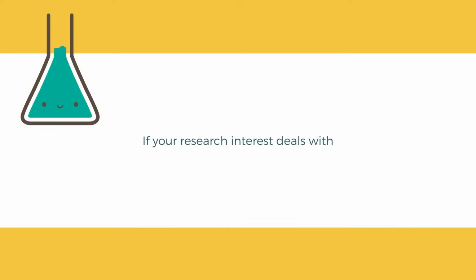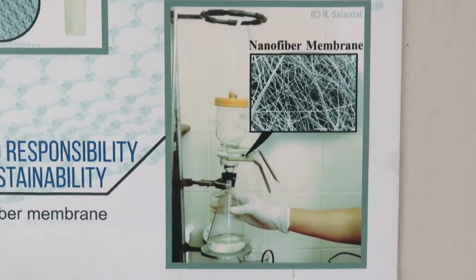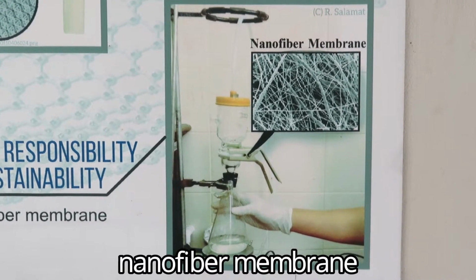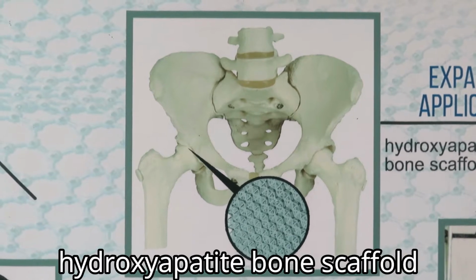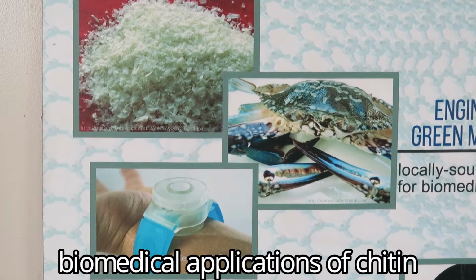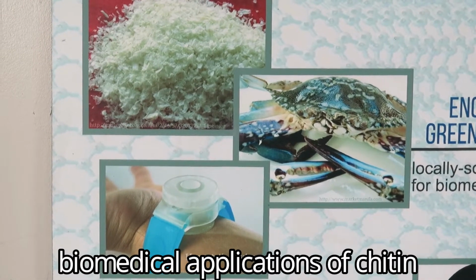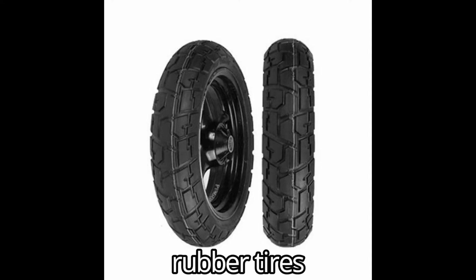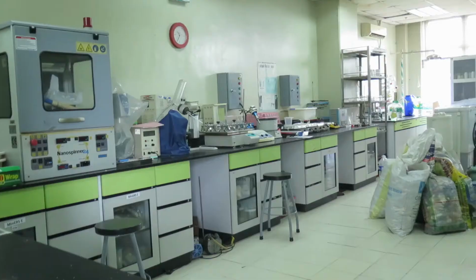So what does this lab do? If your research interest deals with surface-modified nanoclay, nanofiber membrane for filtration, or maybe a hydroxyapatite bone scaffold, or studying the biomedical applications of chitin, making rubber tires, or maybe this, making bioplastic. This is where you want to go.